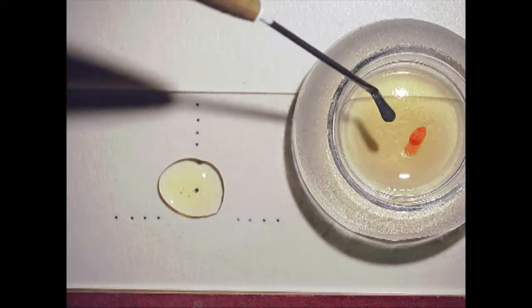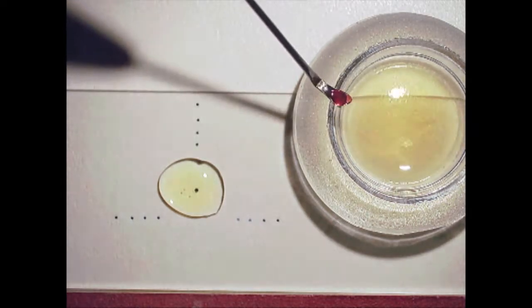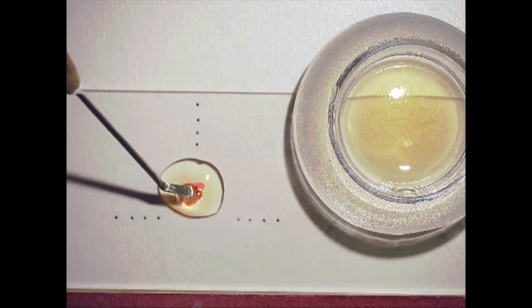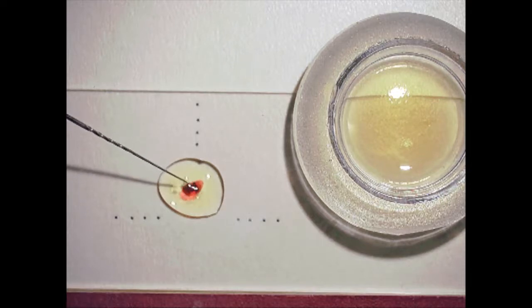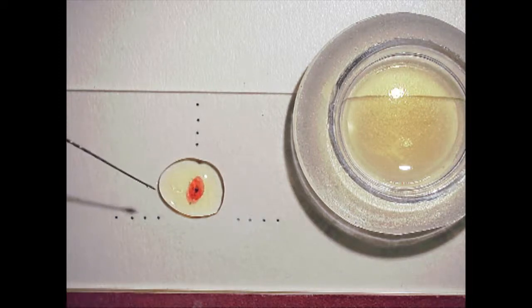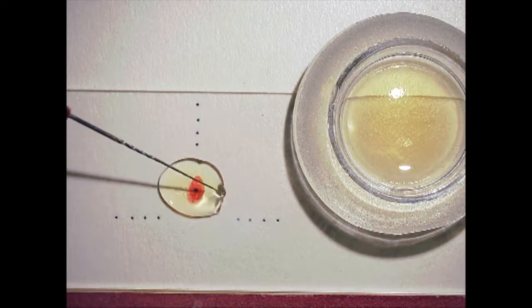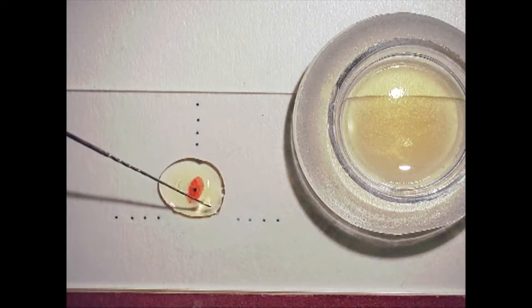Because you've used that spatula in the balsam, you'll want to get another tool because it's sticky. So here we're lifting it up out of the clove oil and placing it directly in the balsam. Bring the specimen down into the balsam to that bullseye mark. Now I'm using the micro probe and just manipulating the specimen so you have it oriented correctly. And you can move the balsam out a little bit. You want to try to get nearly a flat surface because we're going to put a cover slip over top of the specimen next.